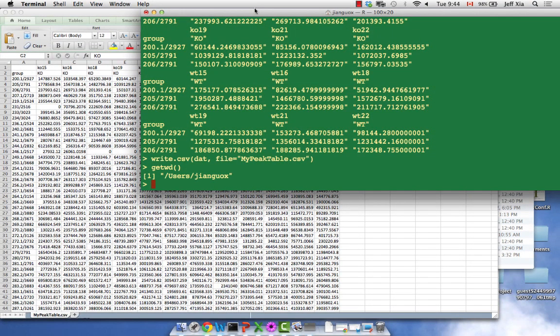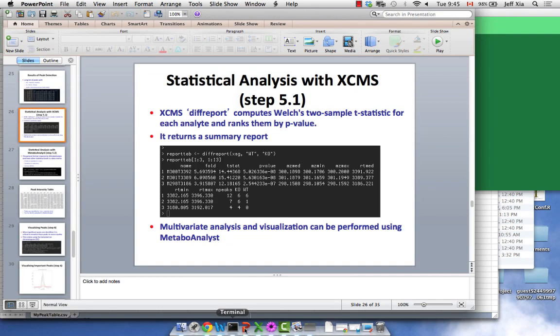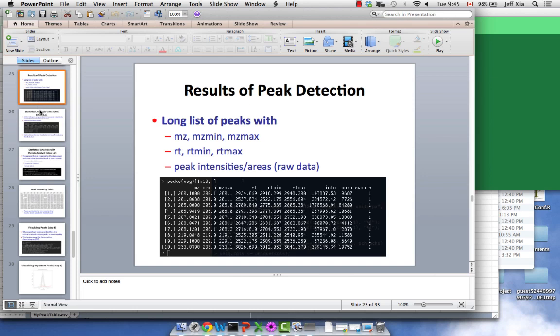The goal is to tell which sample is from control or treatment. So essentially you are adding an extra row. Yes, essentially adding an extra row. You can manually insert it: open it from Excel and insert that row. So that's the goal. Any questions so far?